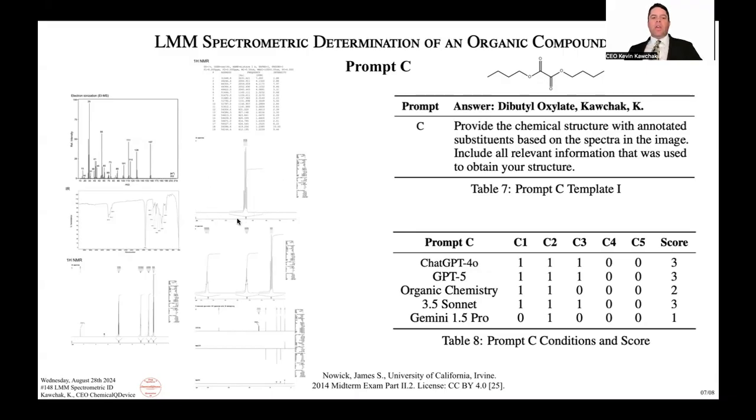Okay. But when I gave this single spectrum, I had most of this solved to GPT-5. It says these protons, whatever this is integrating to, are likely coming from, if it's right next to a highly electronegative atom like oxygen, the two protons further away than itself, as a doublet of doublets.